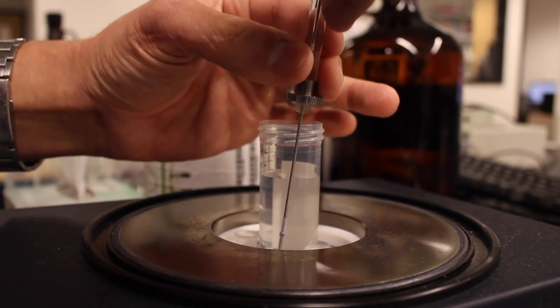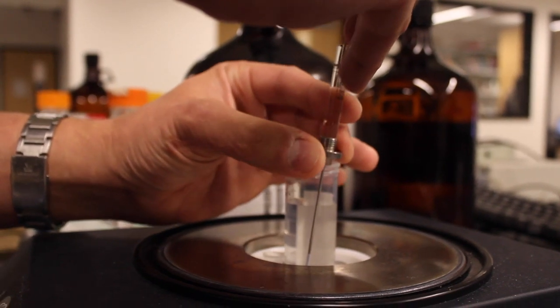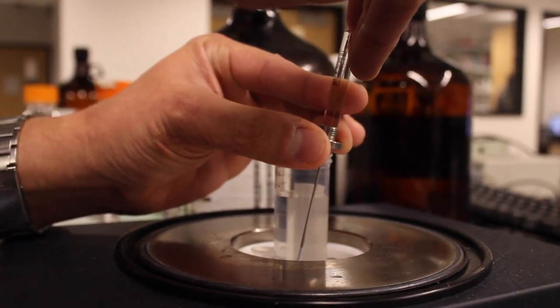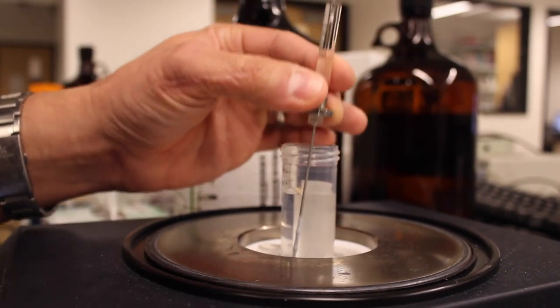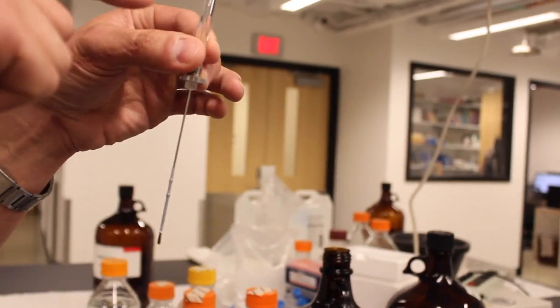and push the plunger down until liquid starts coming out of the bottom of the syringe and then we can put the syringe back into the solution and draw it up typically to the 50 microliter mark on the top here and now the syringe is completely full from top to bottom.